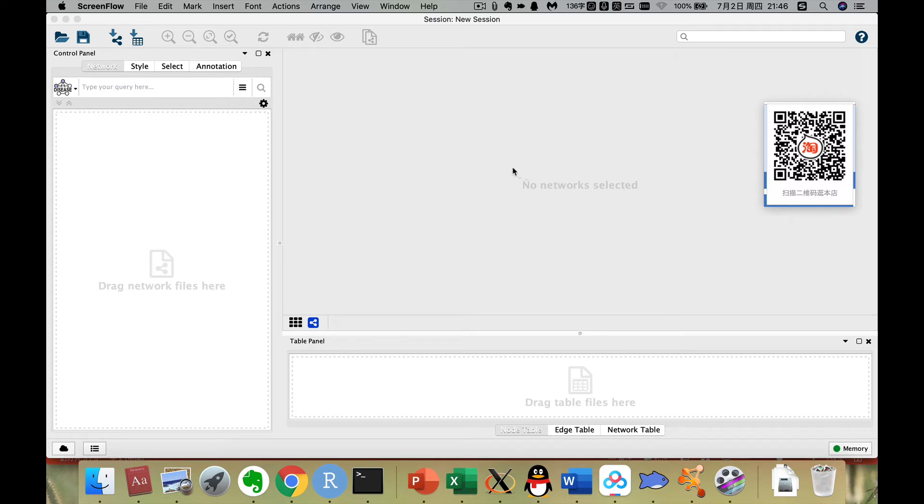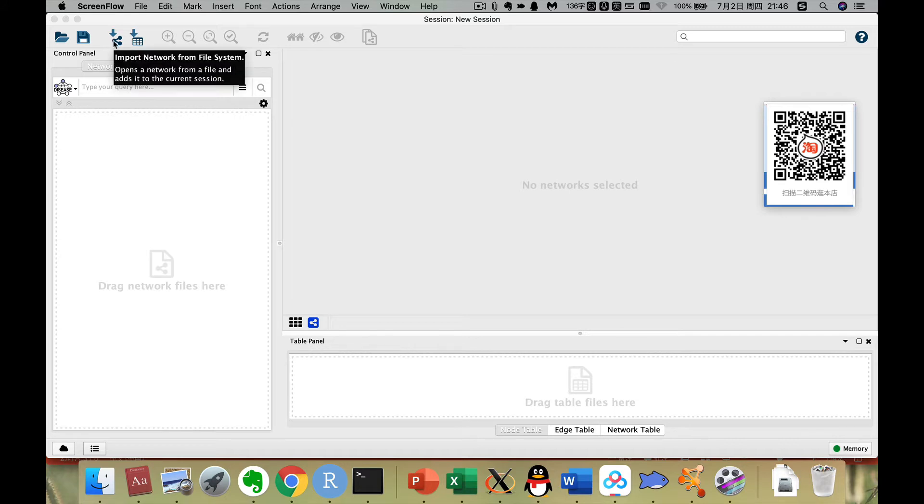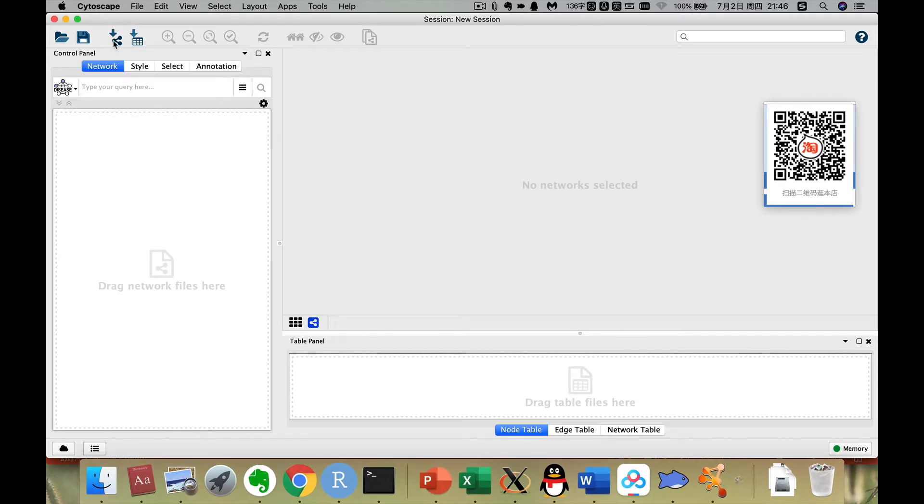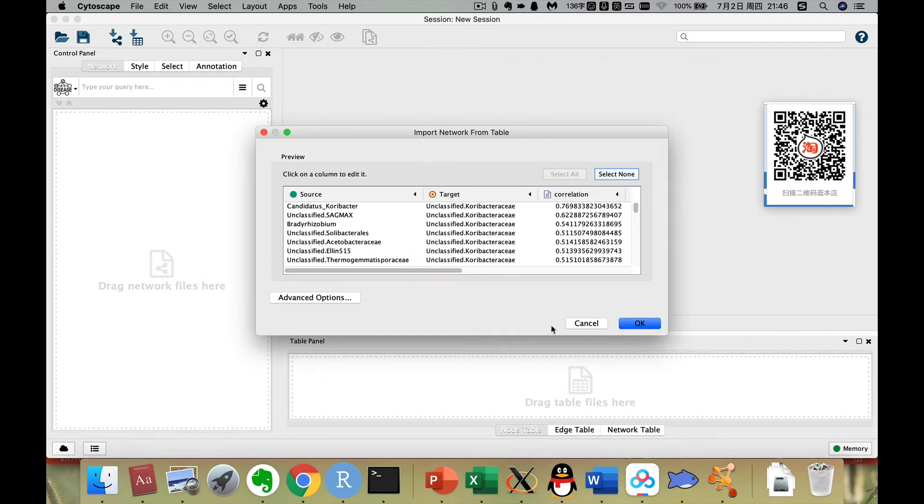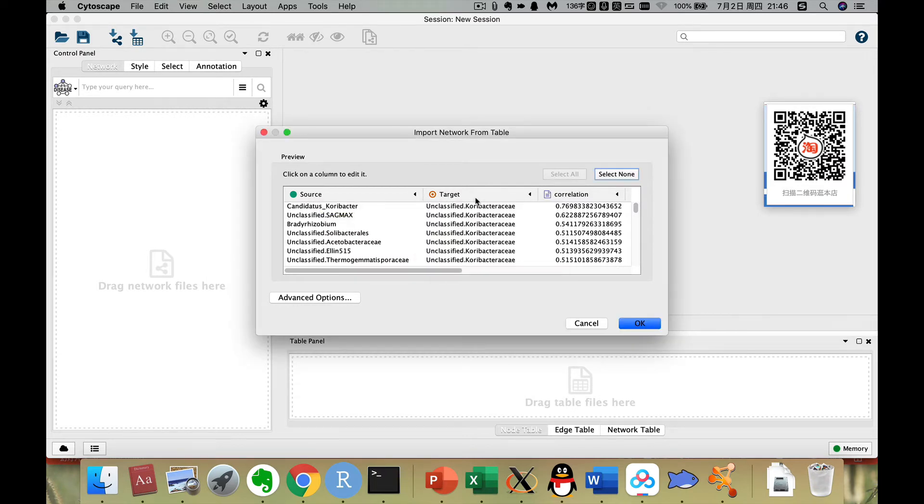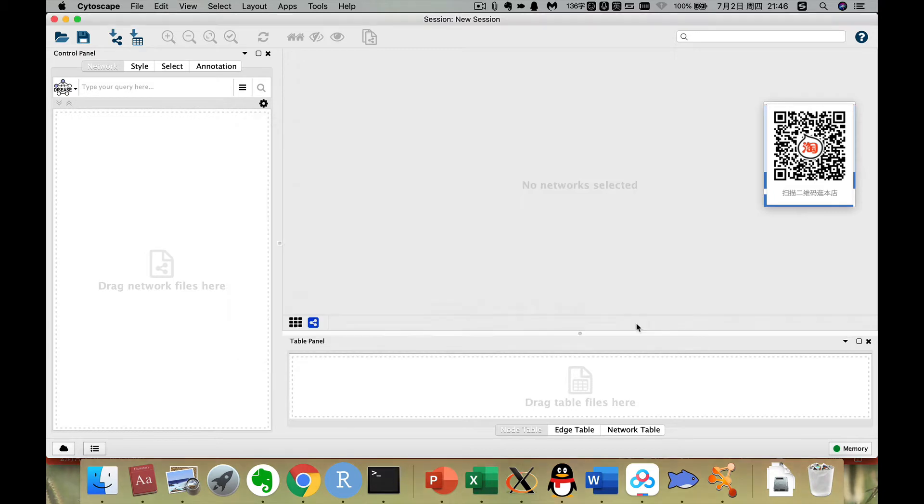After we got the correlation table, first we import network from file system. Now we choose the network.txt and we open. Then it can recognize the source as source, the target as target attribute. And we click OK.